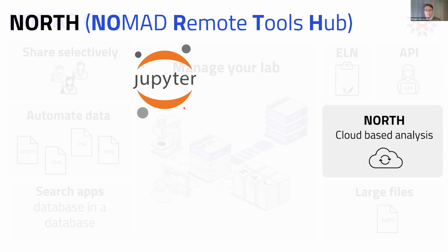And it also makes the analysis more FAIR because we are starting to develop schemas for actually recognizing these Jupyter notebooks and understanding what is happening in them, so that the analysis itself can also be stored as part of the record, and that when you create a publication of this dataset later, the actual analysis is part of this and shipped with it. It also integrates with NOMAD and so on.